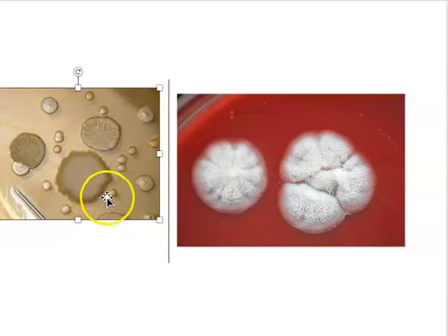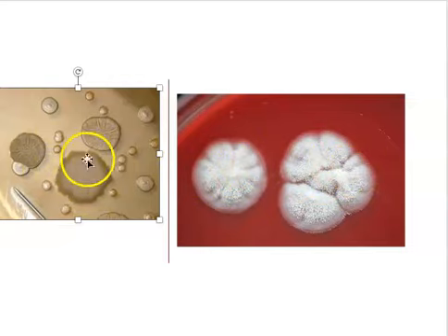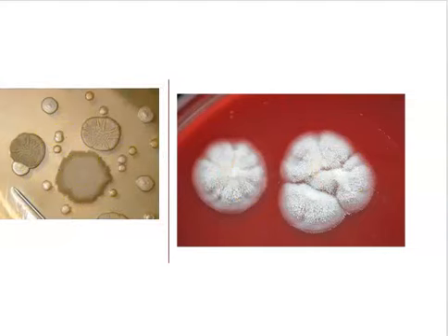It looks like bacteria. In comparison, over here on this plate, I've got something really fuzzy growing, something quite irregular and really fungal looking. But guess what? It turned out that this organism is actually a bacterium, and this is actually a fungus. So remember, you cannot judge whether you've got a bacterium or a fungus until you take cells under the microscope.